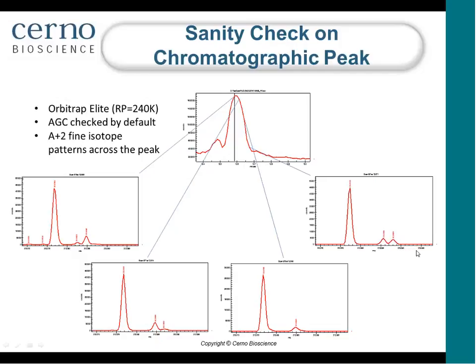And this is mystifying and extremely puzzling in terms of unknown ID, because which scan should we trust, and which one would be the one that we would base off to do the fine isotope counting to determine whether we have particular elements or not, and how many of these particular elements there may be. So we were in a little bit of a bind as to how to proceed.